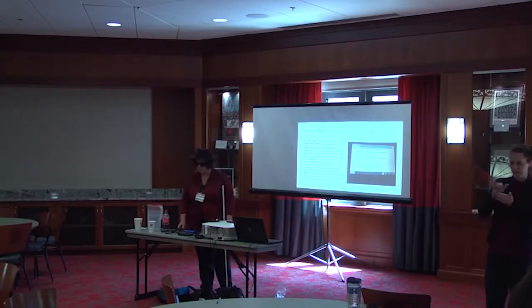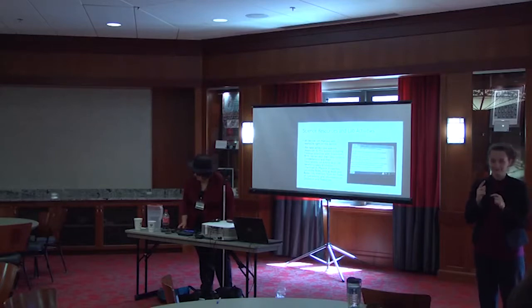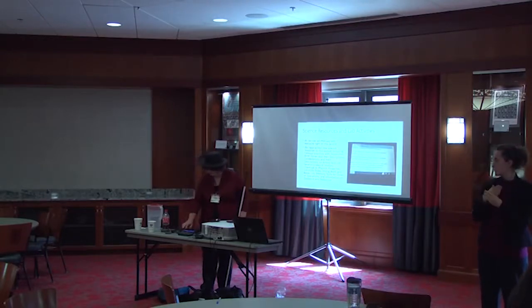So English, it can speak in Spanish, Portuguese, French, Italian, and German. Is anyone in here fluent with any of those? No. Okay, well, English, Deutsch, Espanol, we'll just turn it to Spanish. You know a little bit of changing that language?